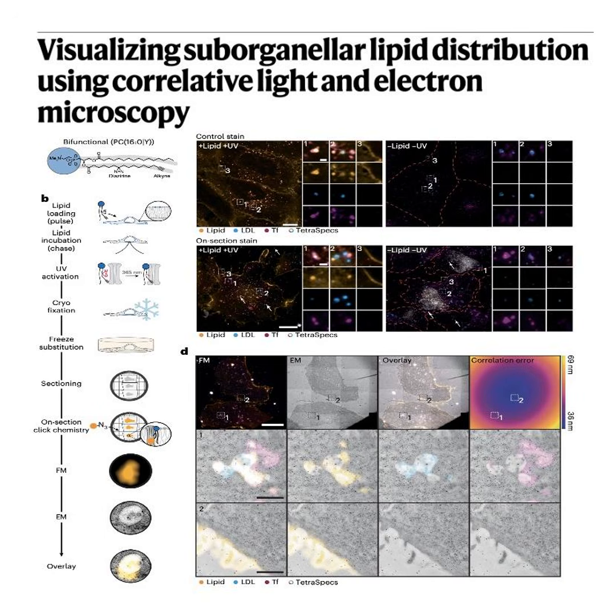Yeah. But to really appreciate how brilliant this Lipid-CLEM workflow is, we first have to talk about why lipids have been so notoriously impossible to film. Right, the visibility problem. The primary hurdle is rapid dynamics. I mean, lipids are chaotic. They move incredibly fast across the membrane. So to track them historically, standard methodology meant tagging them with something that glows under a microscope. Like a fluorescent tag. Exactly, like NBD-PC. But, and correct me if I'm wrong, there's a massive physical flaw with those historical tags. It causes localization artifacts. That is exactly what happens, yeah.